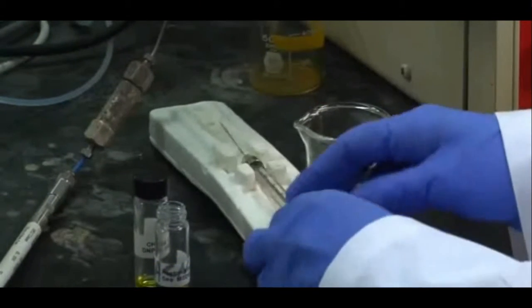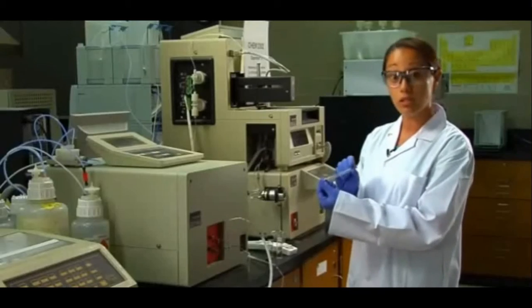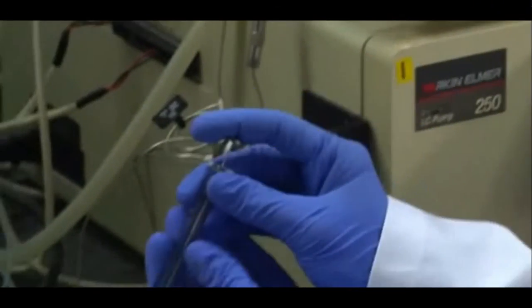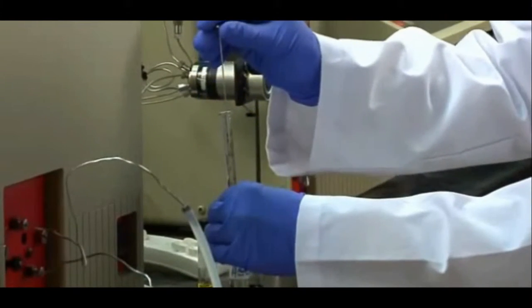The first thing you want to do: you'll find you have a 50 microlitre syringe, so you're just going to make sure you rinse your syringe three times to remove any contaminants that may interfere with your analysis.